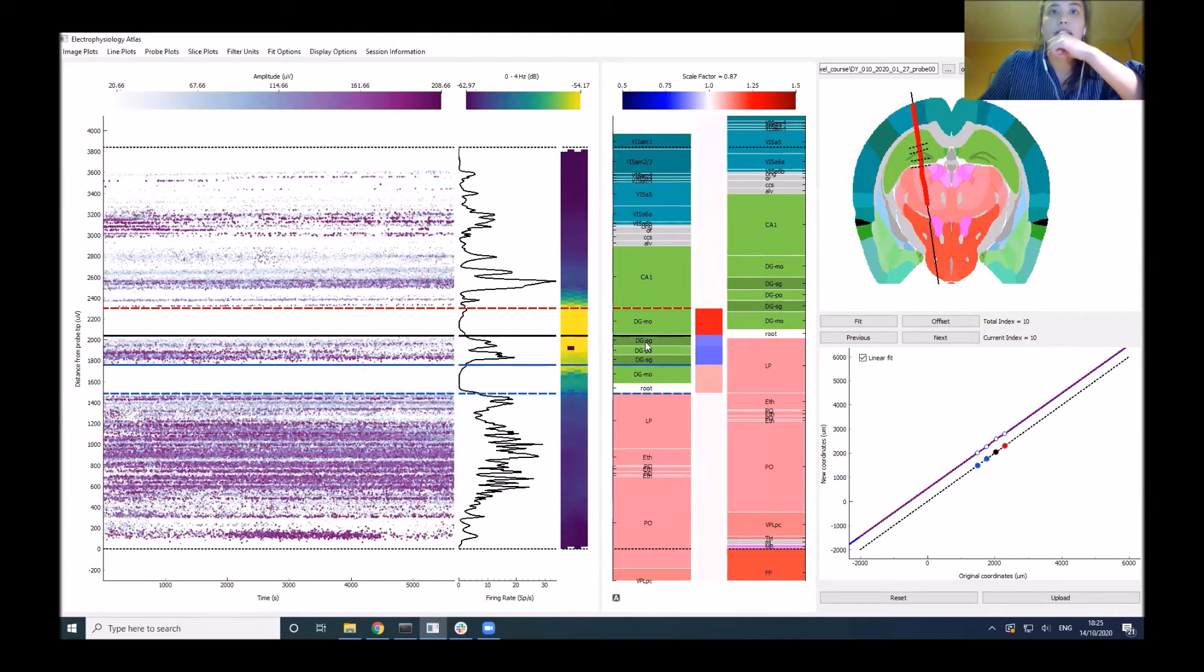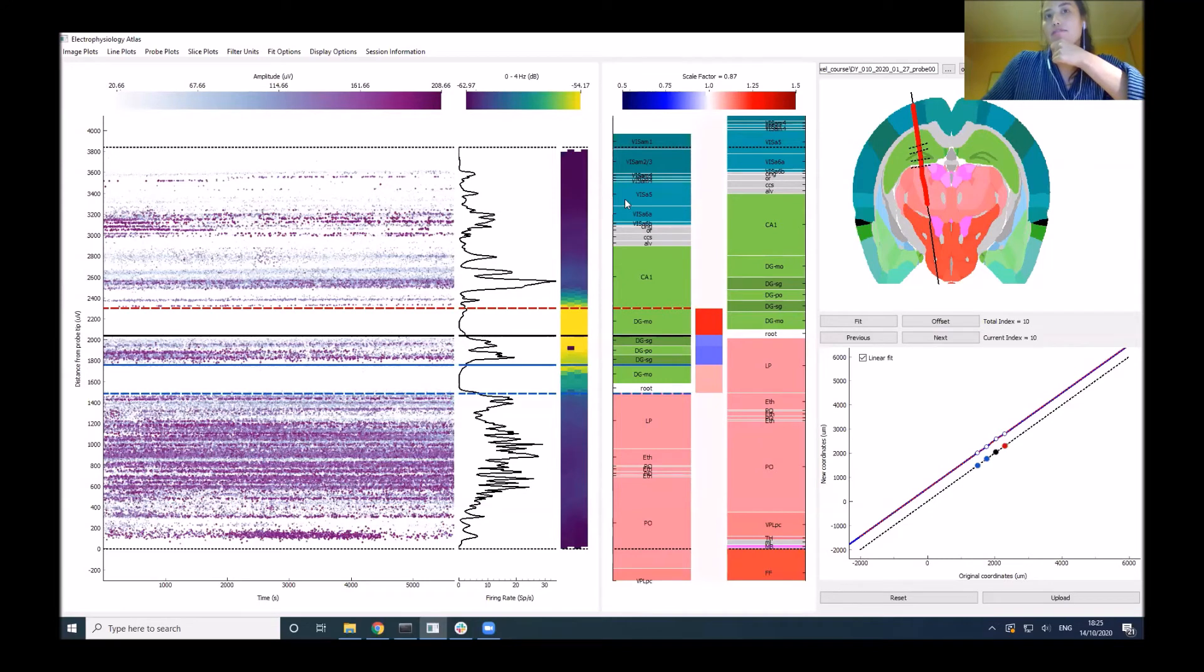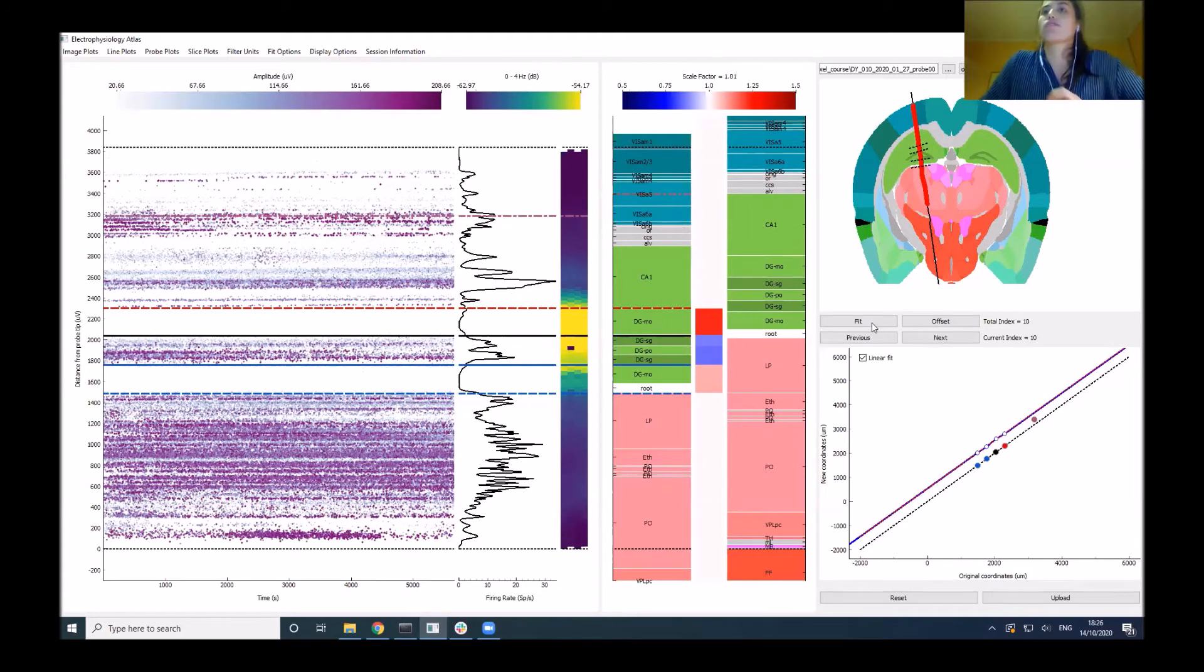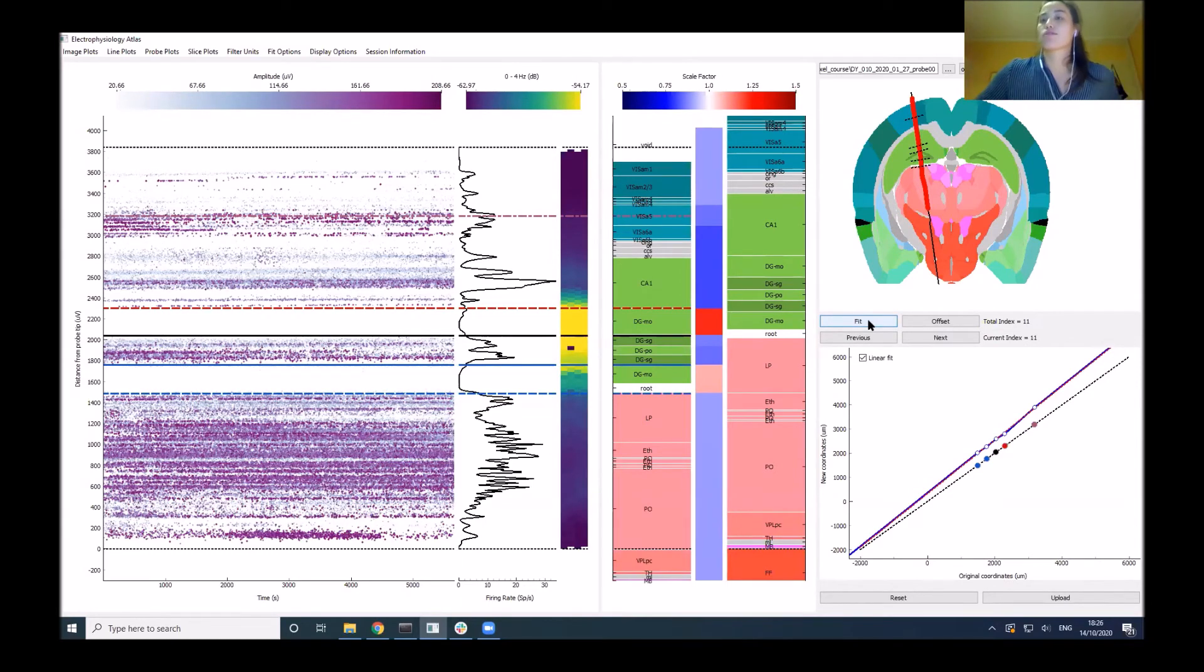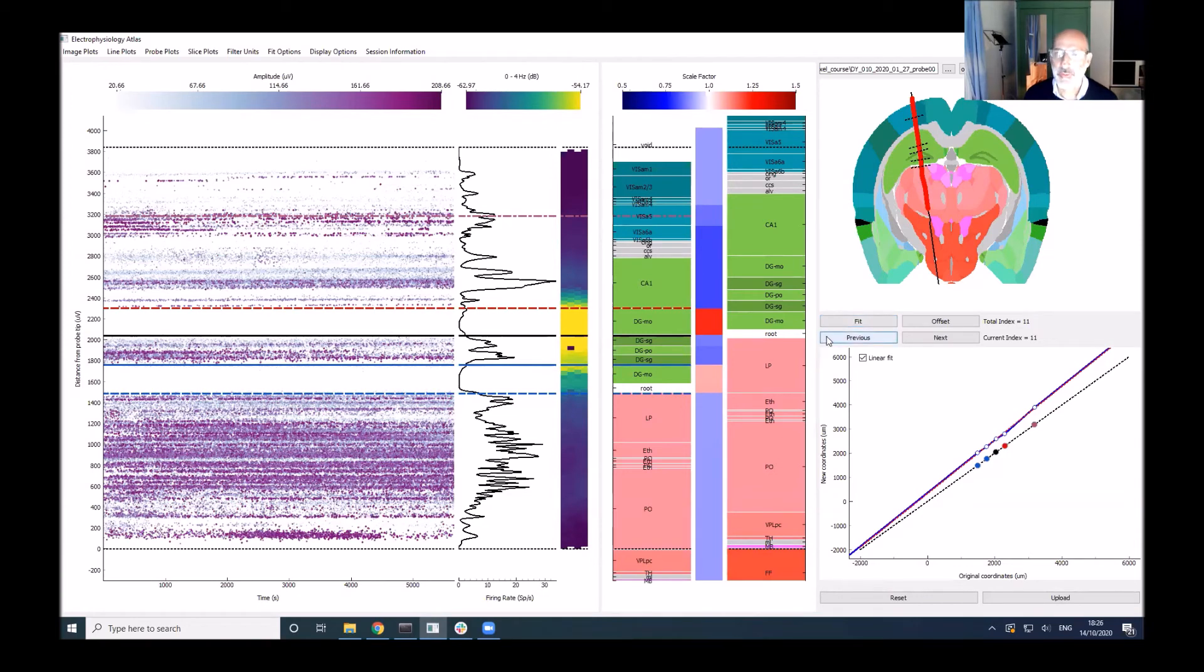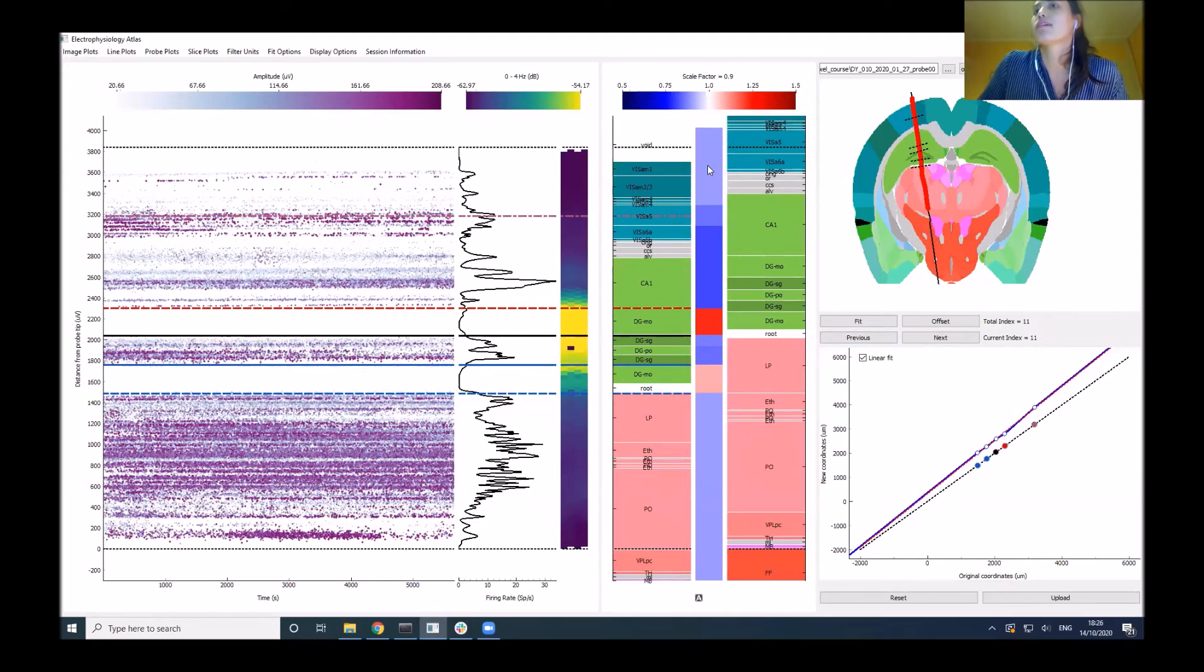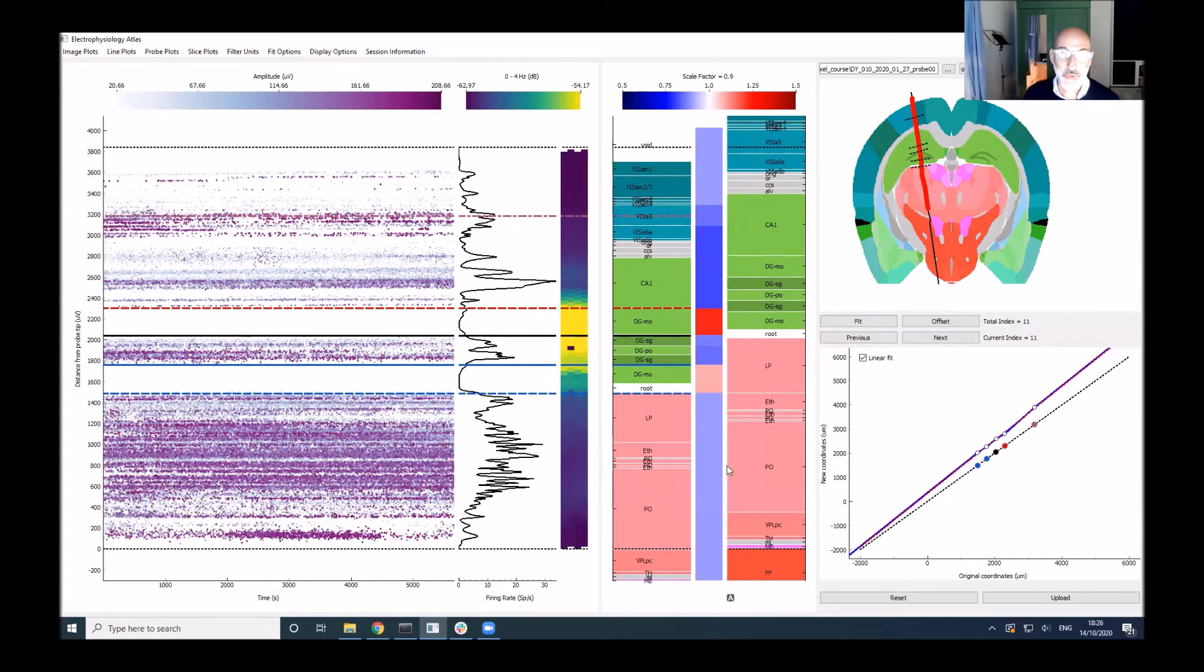The next thing I'd probably align would be this high firing rate region, which I'd identify as layer five in the visual cortex. I would roughly locate this around the center and apply a fit. We can see we've actually compressed or stretched the electrodes quite a bit. Overall, we stretched it by a factor of 0.9, so 10%, and locally up to 20%. If you don't do this, you might be off by quite a bit.